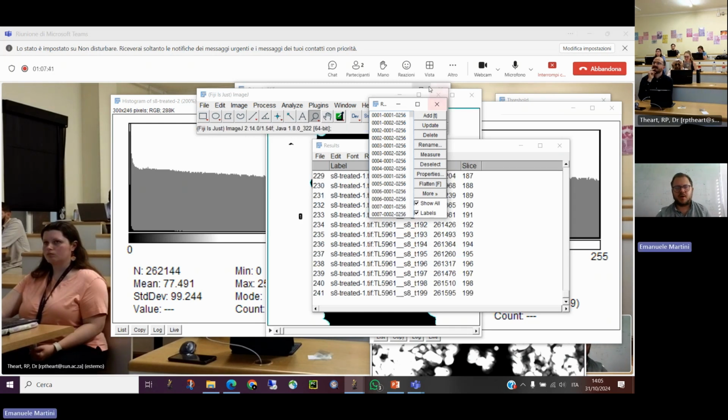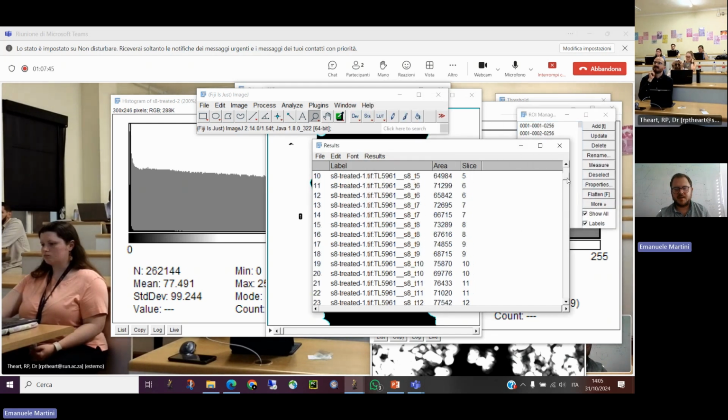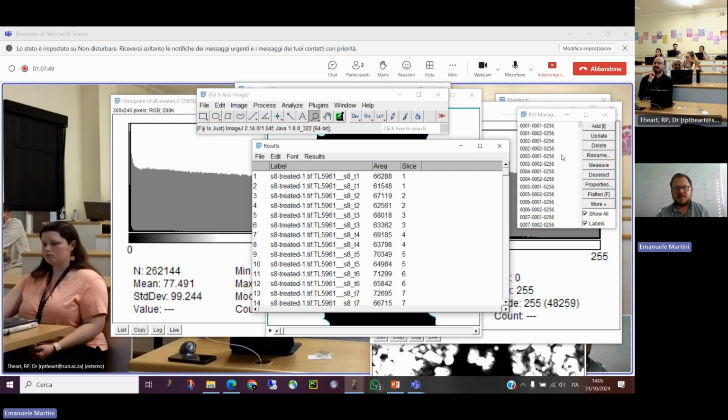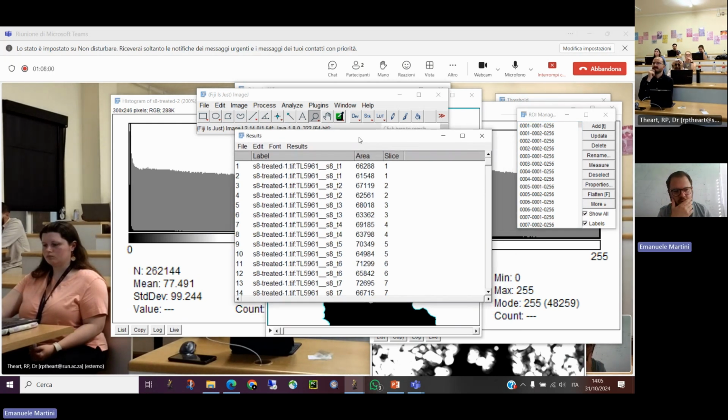If everybody has reached this point, something like that, with the result showing the area and the ROI manager filled with objects, it means we are good. We are moving ahead.